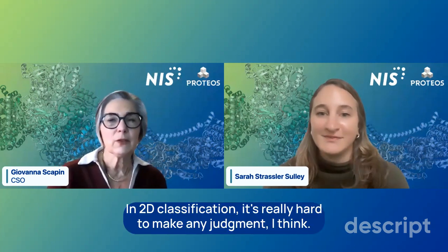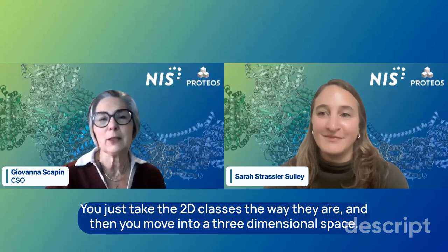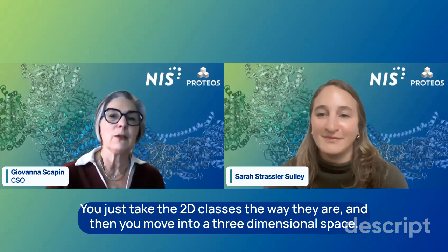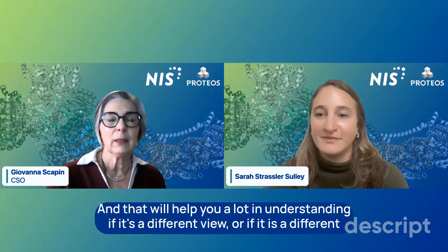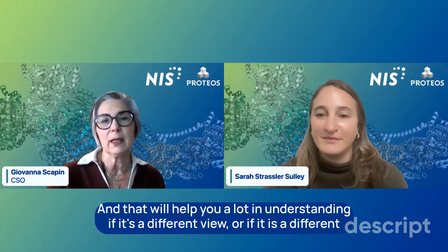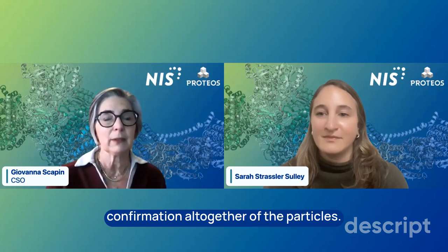In 2D classification, it's really hard to make any judgment, I think. You just take the 2D classes the way they are, and then you move into a three-dimensional space. And that will help you a lot in understanding if it's a different view or if it is a different conformation altogether of the particles.